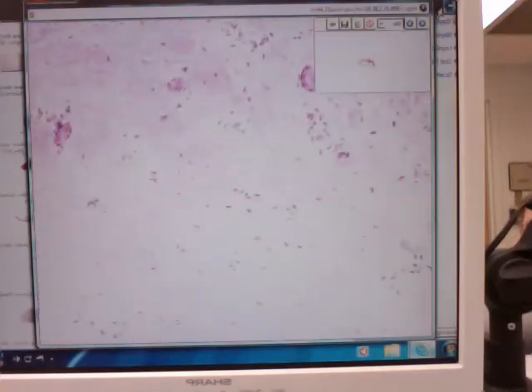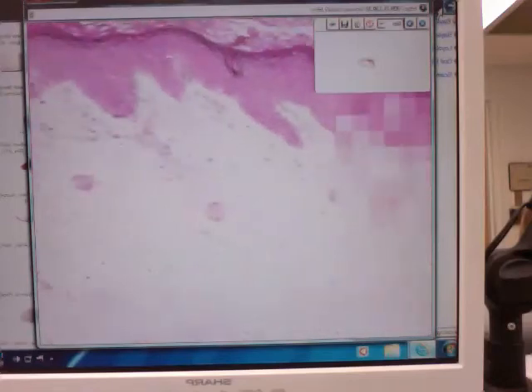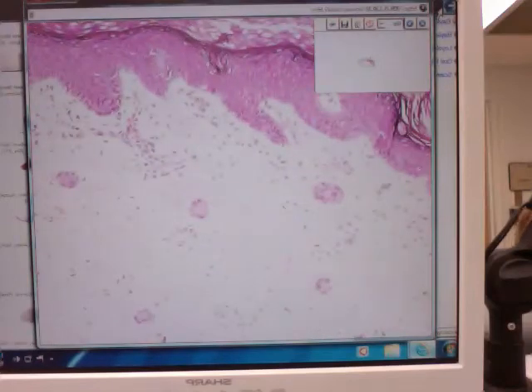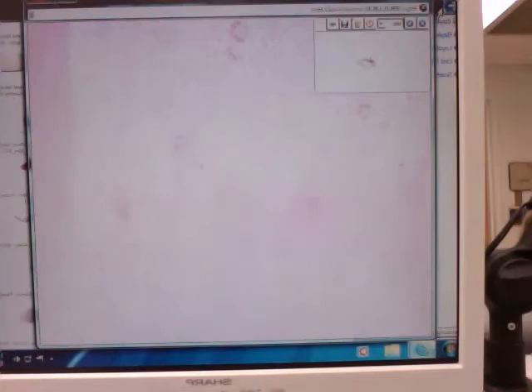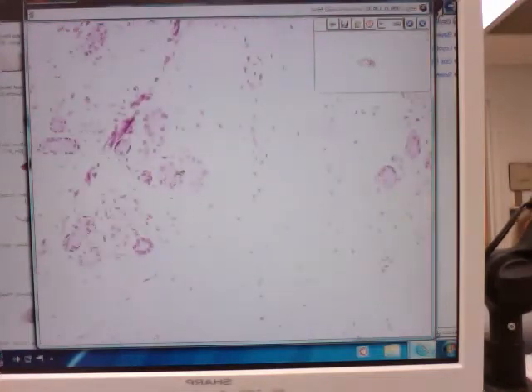Dense irregular, some pieces of loose connective tissue, but you definitely see that loose connective tissue up here underneath the epithelium. All loose connective tissue, dense irregular. This is the simple coiled tubular gland, the duct portion of it. Secretory portion, and a little piece of the duct right behind it.